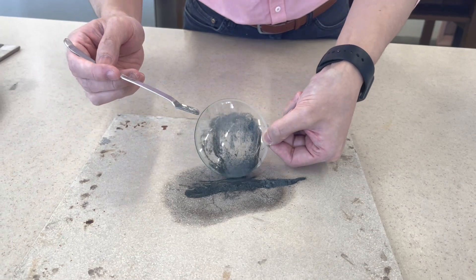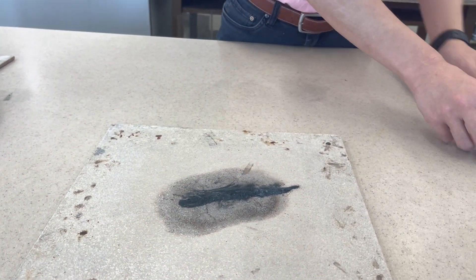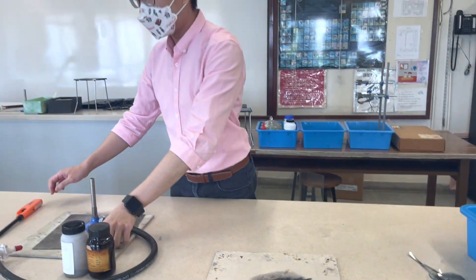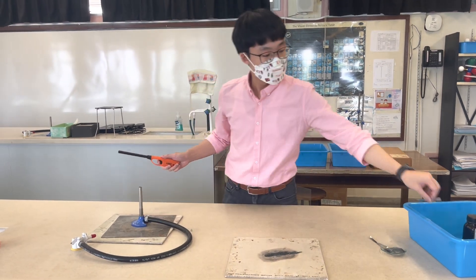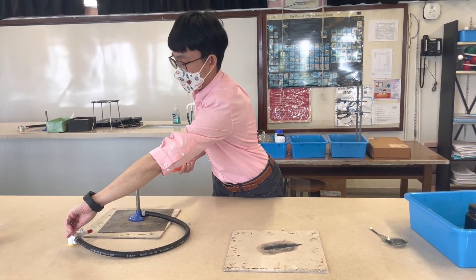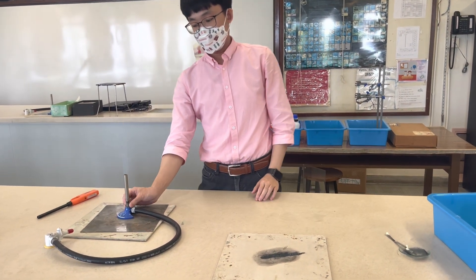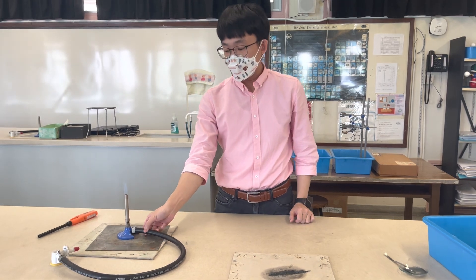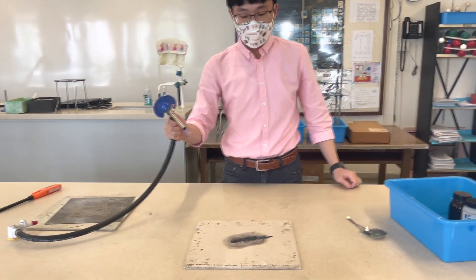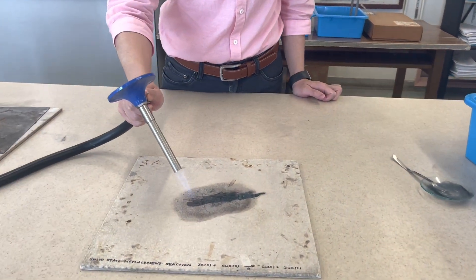I'm going to use a torch — or actually an inverted Bunsen burner — in order to ignite it. Right now I have a Bunsen flame serving as a torch and I'm going to ignite it. Observe very carefully what happens.